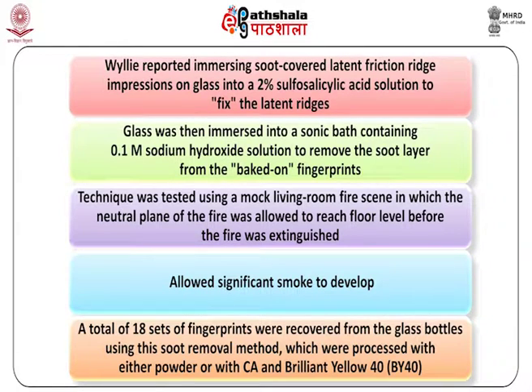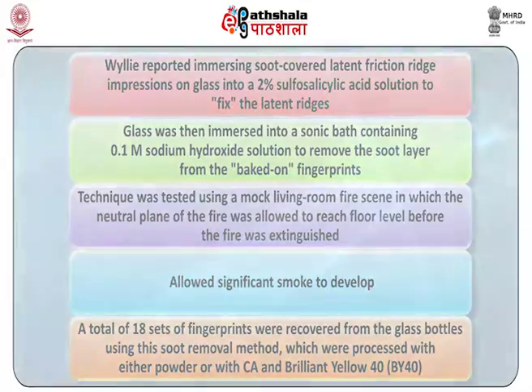A total of 18 sets of fingerprints were recovered from the glass bottles using this soot removal method, and were processed with either powder or with cyanoacrylate and brilliant yellow 40, that is BY40.